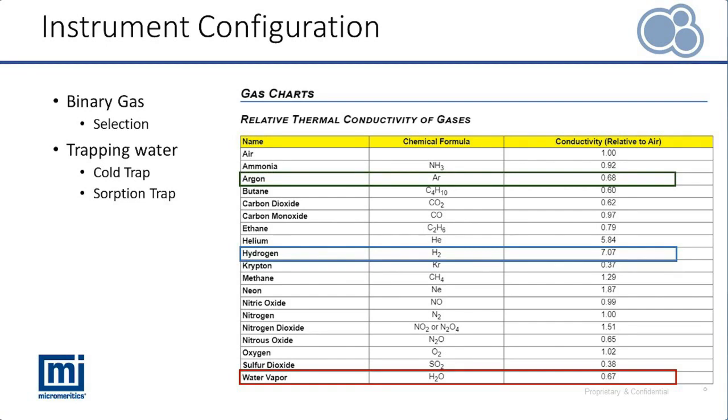Experiments that require a longer reduction time due to a low heating rate or high temperature ranges may encounter issues. Preparation of the slurry requires experience and is time-consuming. Most importantly, it requires more user intervention. Users need to return to the instrument at the start and load the cold trap.